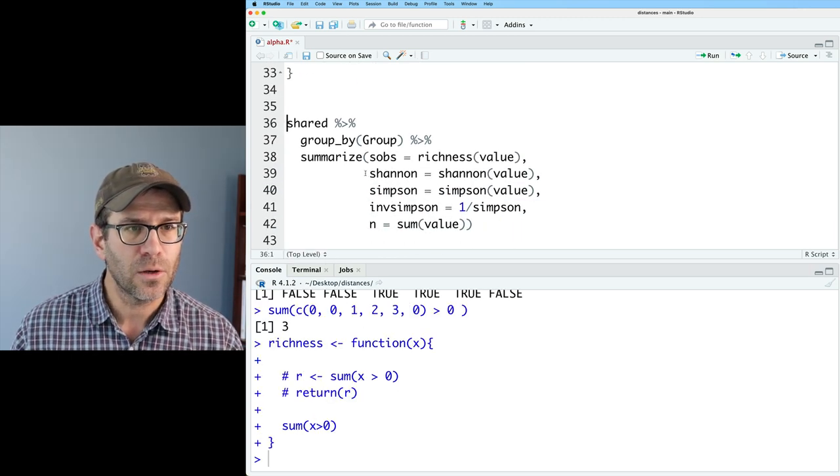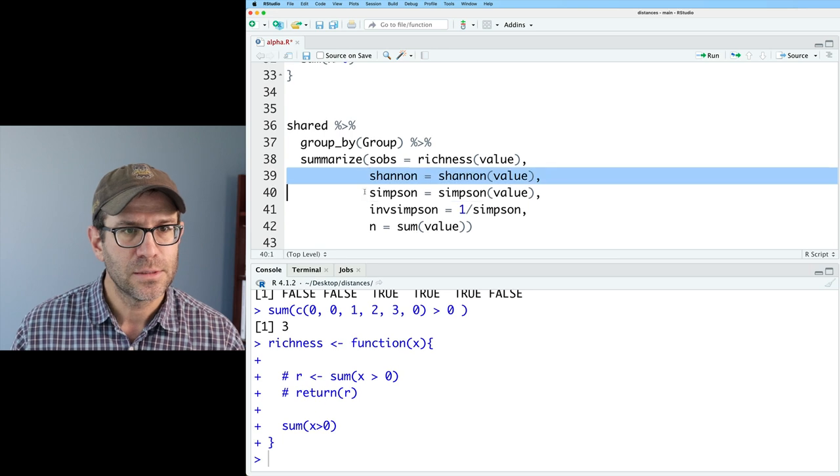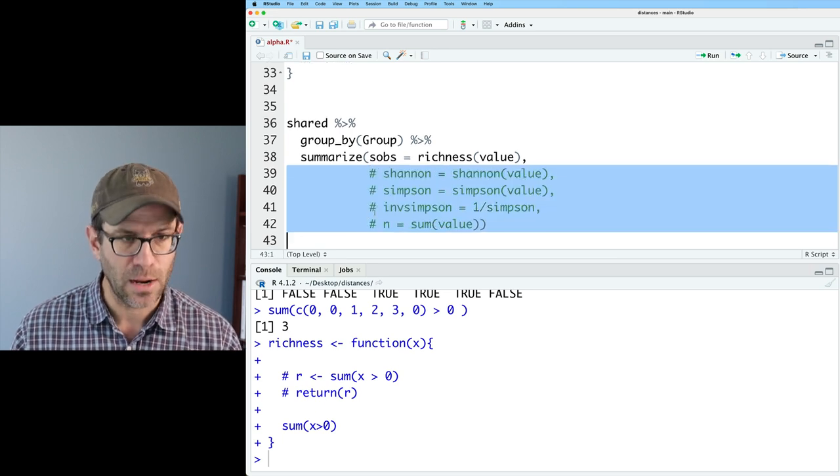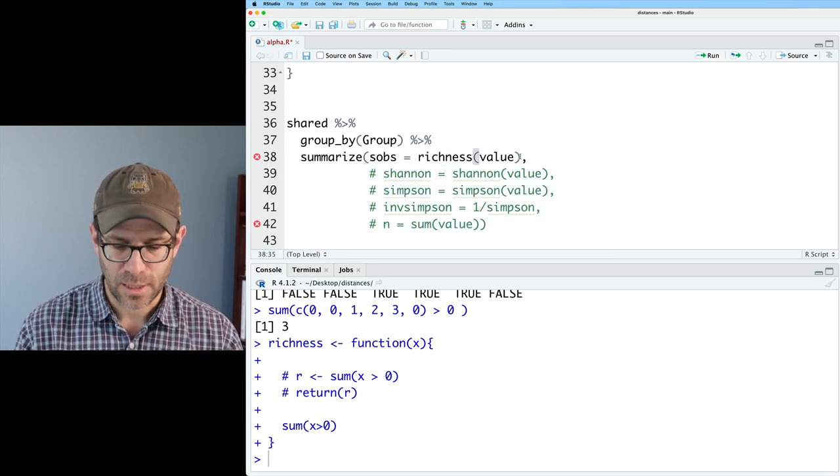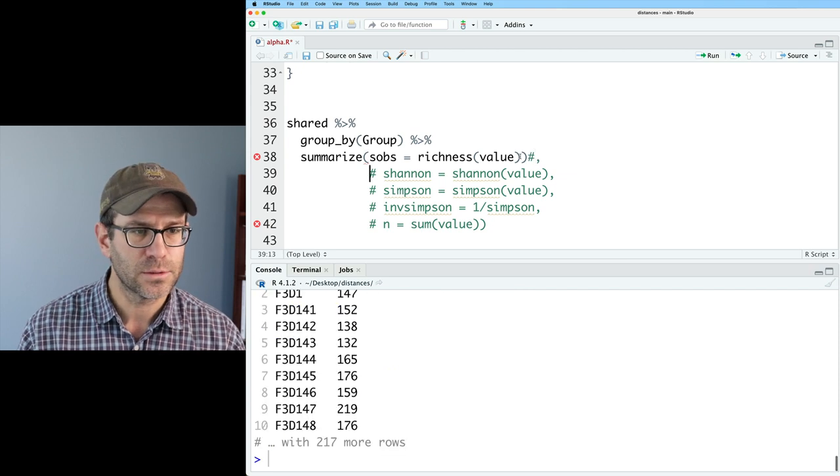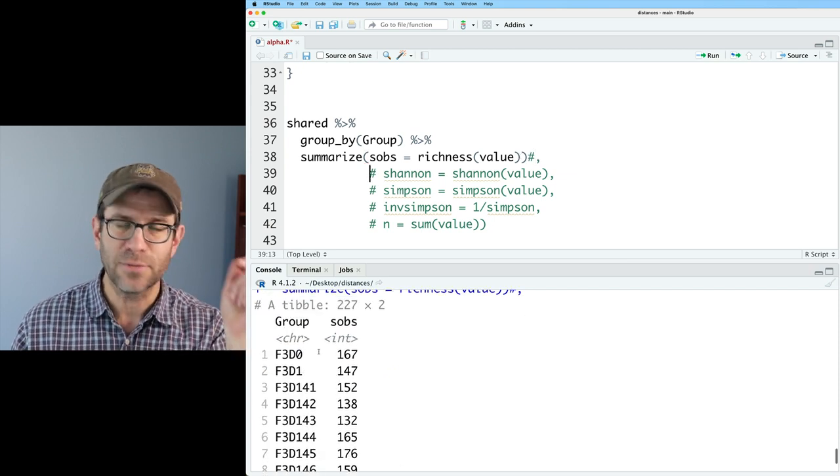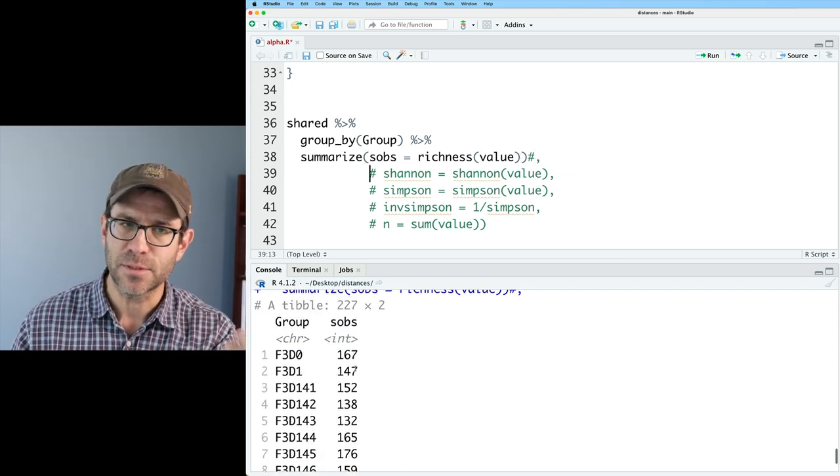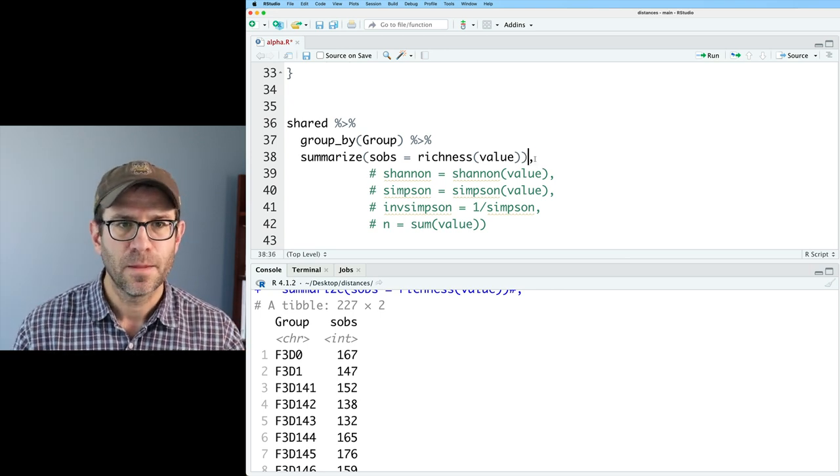And I'm going to go ahead and comment out some of these extra lines in here for now. So we can kind of confirm to ourself that this code works. And so now what I see is I've got the group column and sobs, the richness. Now what we want to look at is Shannon.